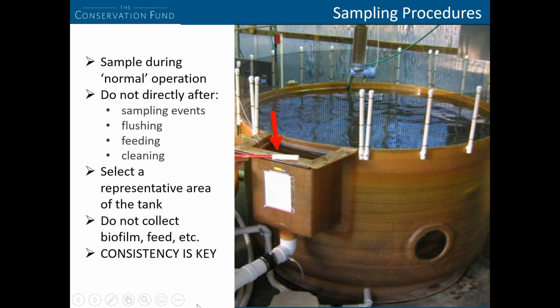You also don't want to collect samples or take in situ measurements at the bottom drain of your tank. This is the area where you'll have high solids collection, higher organics, and TAN, as well as lower DO due to degradation of materials.